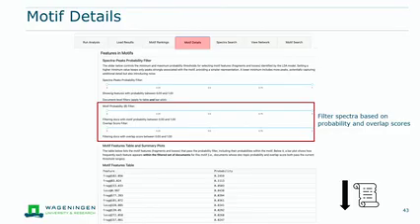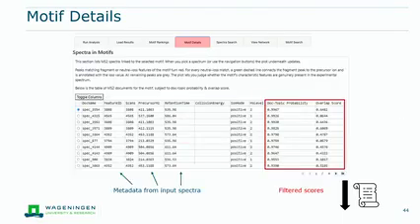All right. Then this is a really, really long tab and page. And nearly the last piece of information you can get out of the master motif, which I think is really interesting for then having a deeper look again at the spectra used as an input, is the spectra and motif section. What you can see here, first, is some metadata about the input spectra. So let's say you have your tomato spiked dataset, and then you can see all spectra that are related, so the original spectra related to this master motif.